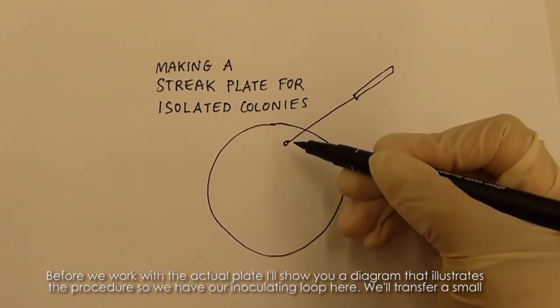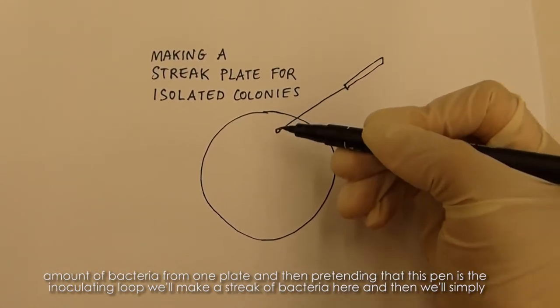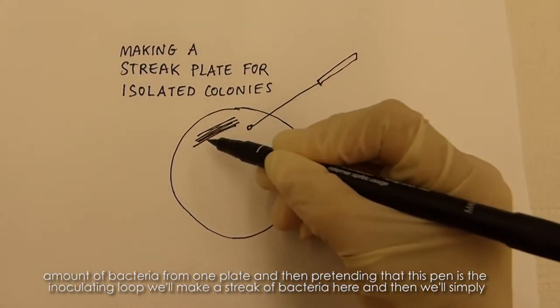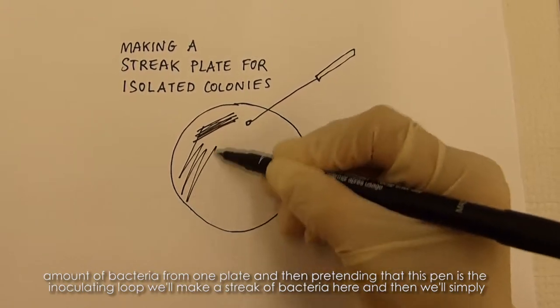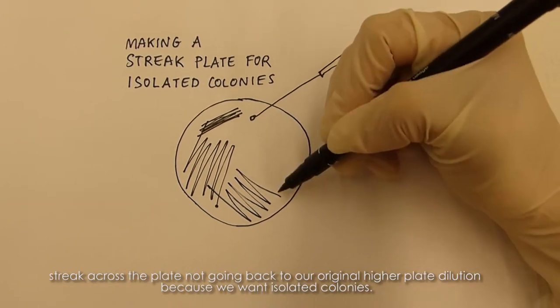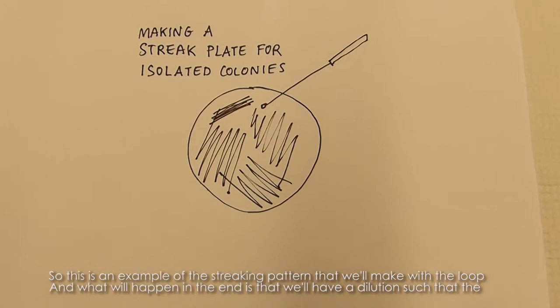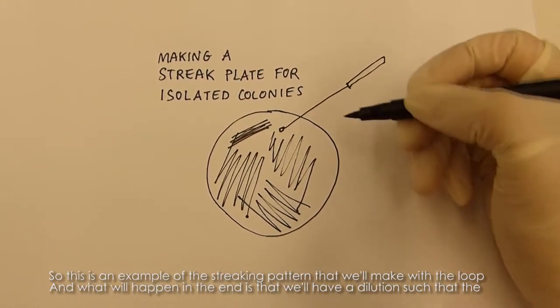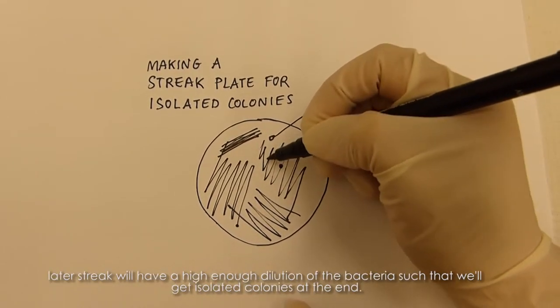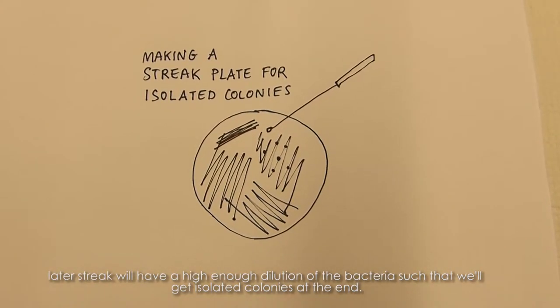We have our inoculating loop here. We'll transfer a small amount of bacteria from one plate, and then — pretending that this pen is the inoculating loop — we'll make a streak of bacteria here. Then we'll simply streak across the plate, not going back to our original higher-concentration area, because we want isolated colonies. This is an example of the streaking pattern we'll make. The later streaks will have a high enough dilution of bacteria to yield isolated colonies at the end.